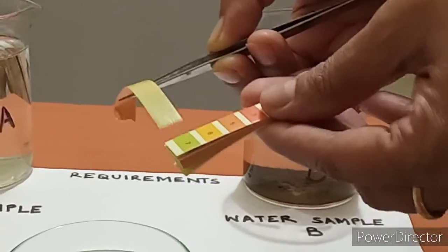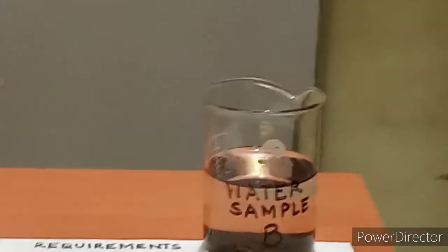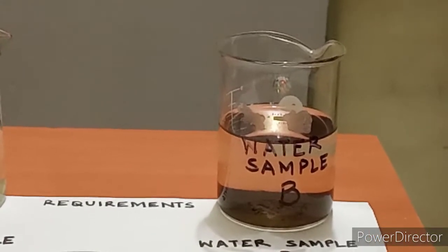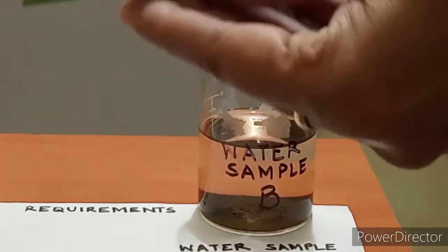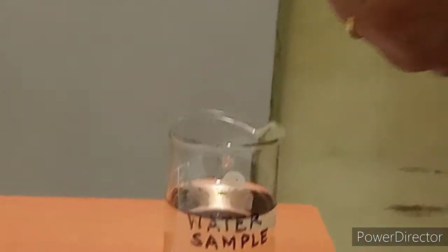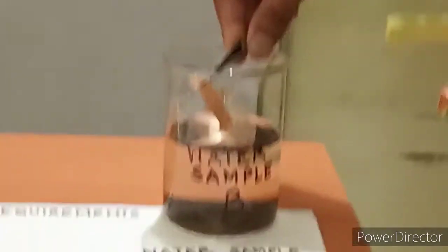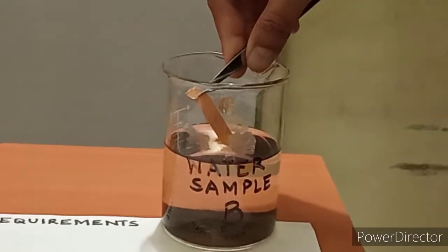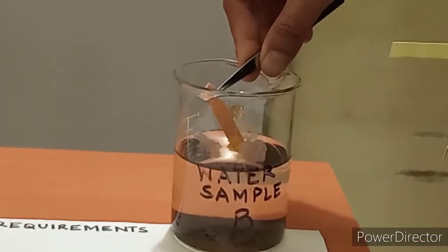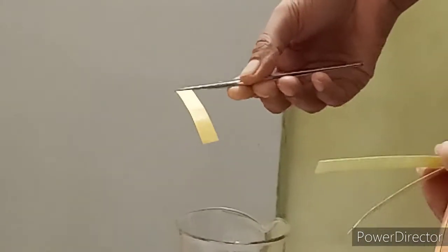In the same way we are going to repeat it for water sample B. Again we are going to take the pH paper and dip it in sample B, which has been collected from a pond. Dip it for some time. Lift the pH paper.